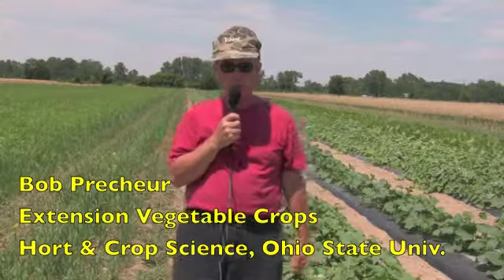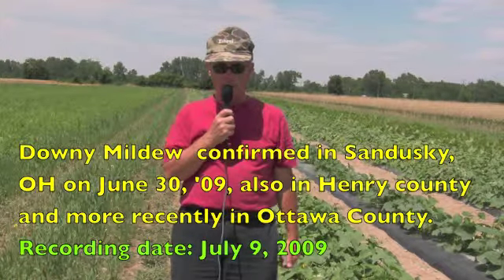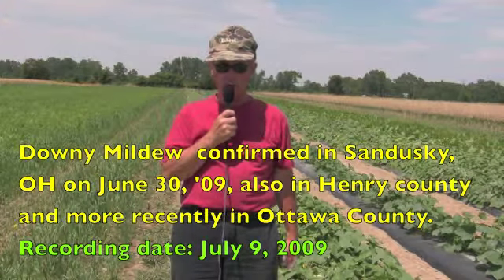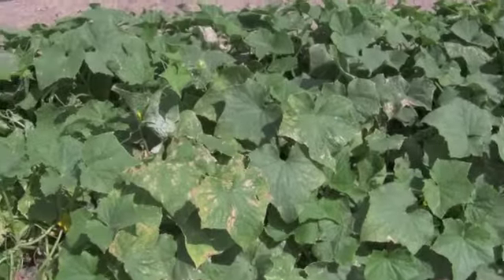Today we want to go through the process of how you take and submit samples to the Plant, Pest, and Diagnostic Clinic. This is especially important when you have some kind of disease or other problem which you're not sure about. With the recent discovery of downy mildew in northern Ohio and cucumber crops being very susceptible to downy mildew, we want to check this field out to make sure nothing serious is going on here.